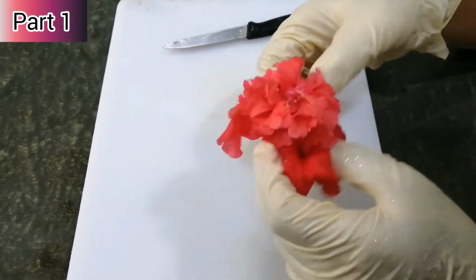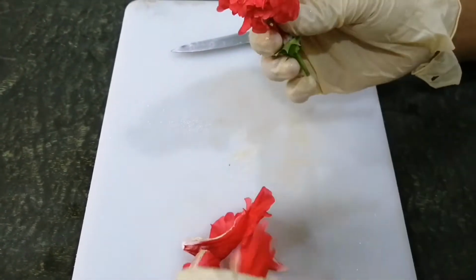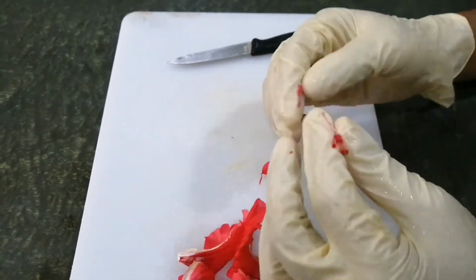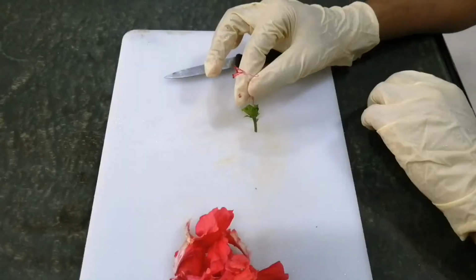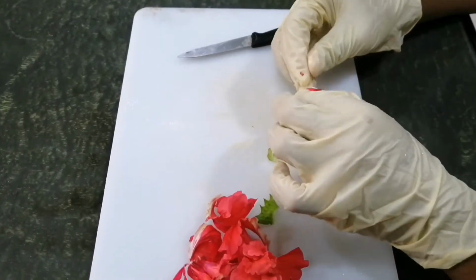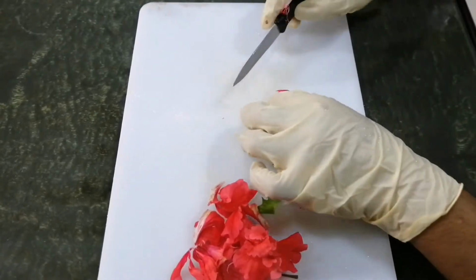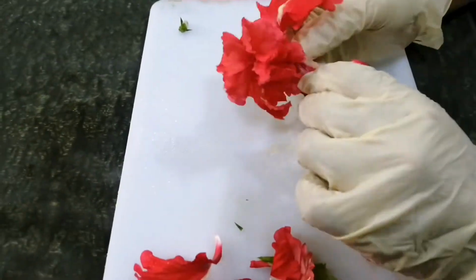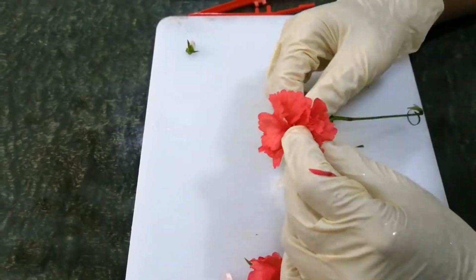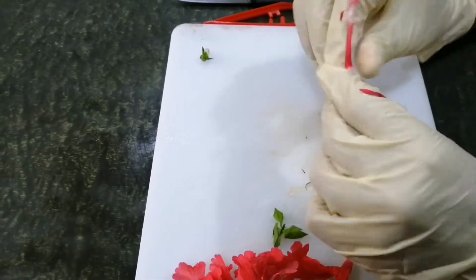So for the first part of this practical, after preparing the materials such as hibiscus and petri dish, we need to trim the hibiscus flower by removing the petals. Next, we trim the style of the hibiscus. After that, I repeat these steps on the second hibiscus flower. So I remove the petals and then I trim the style.